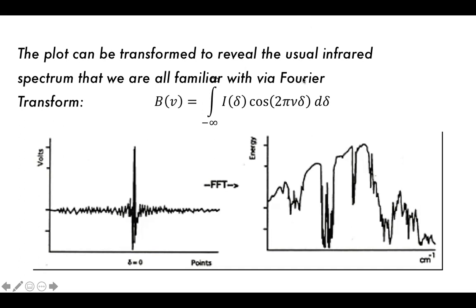And that's pretty much the inner workings of an FTIR spectrometer. There's quite a lot to deal with there. I think the major takeaways here are what a Michelson interferometer does and how it creates 2 different path lengths for the light. Then we're measuring the differences between those so that we get our interferogram, which is basically just the spectrum created from the differences between what the 2 path lengths obtain in information from the sample. And then from that, we can Fourier transform it to get our actual spectrum.